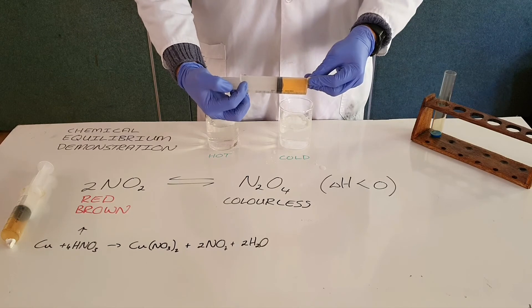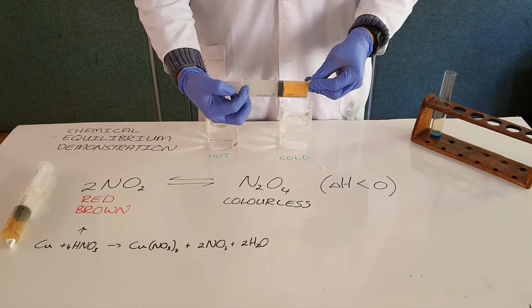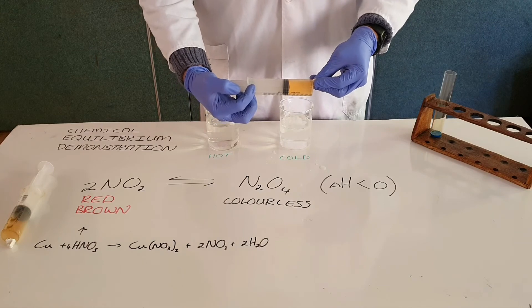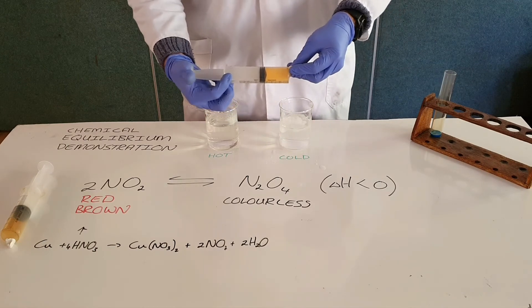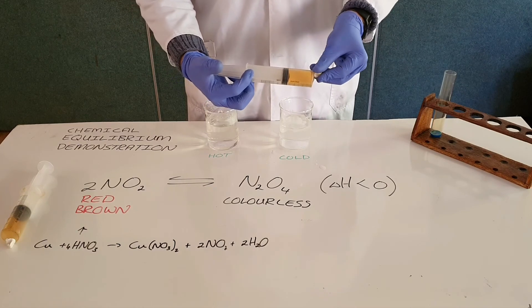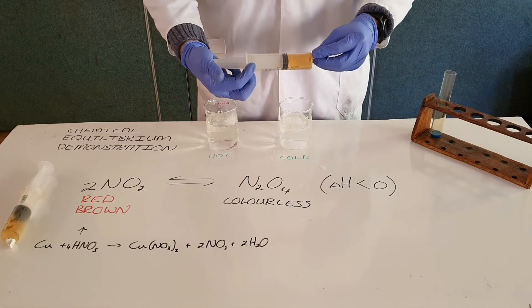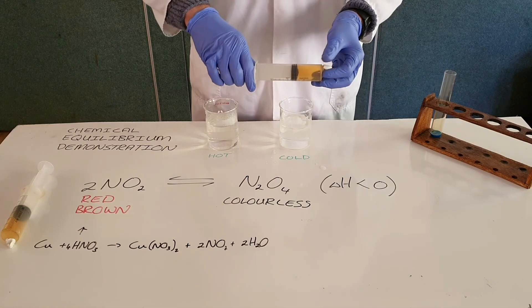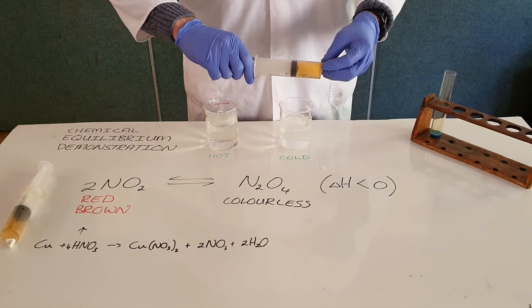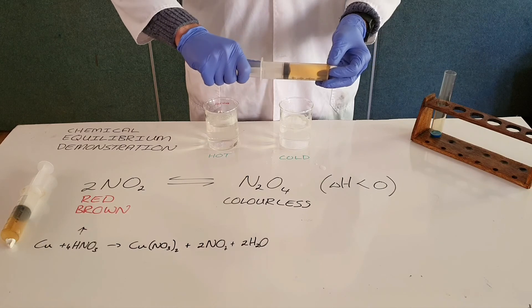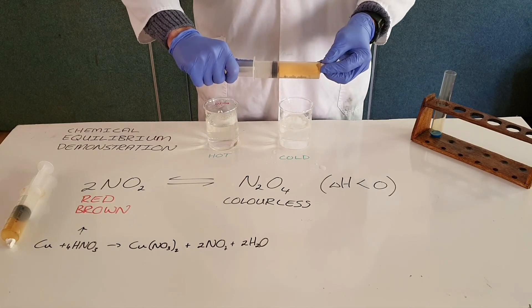The opposite is also true. If I now increase the volume of this container, there is more space available, which means we favor the reverse reaction that produces more molecules — nitrogen dioxide, which is red-brown. Again, note there will be an initial change first: more space means a lower concentration, so we will initially see the color get slightly weaker or dimmer. Then we will see the reverse reaction favored, producing a more red-brown color. We can see the initial change here, and then as we favor the reverse reaction, the color gets slightly darker.